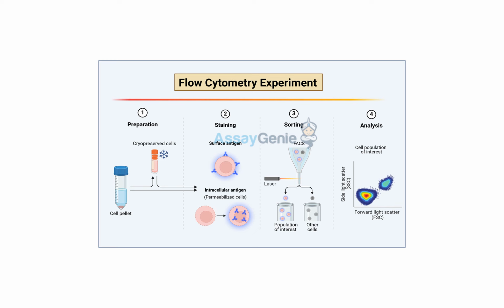Okay. So now we've gotten our antibodies inside the cell. How do we make sure they bind to the right target? Ah, that's a great question. Because cells are packed with all sorts of molecules. Yes, absolutely. We don't want them just grabbing onto anything. We don't want them going rogue. Exactly. So that's where antibody specificity comes in. We have to make sure our antibodies are like highly trained bloodhounds. They need to find our specific protein and nothing else.